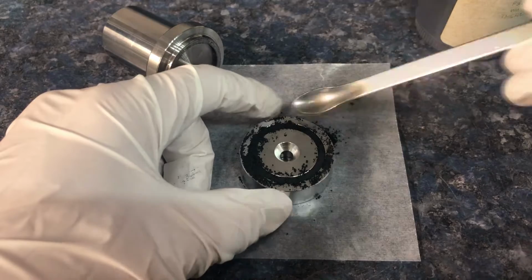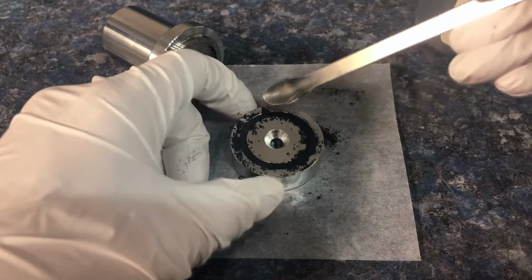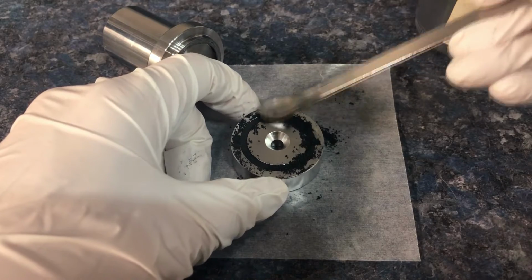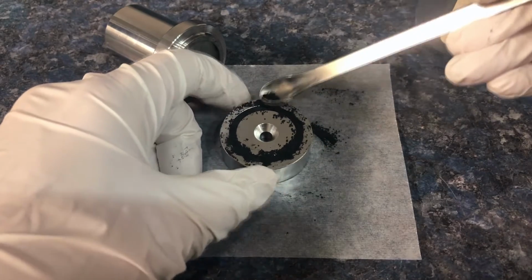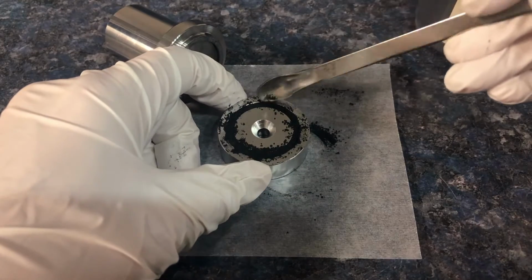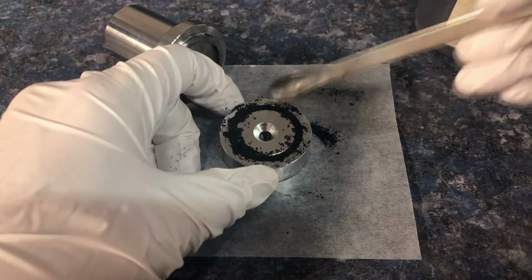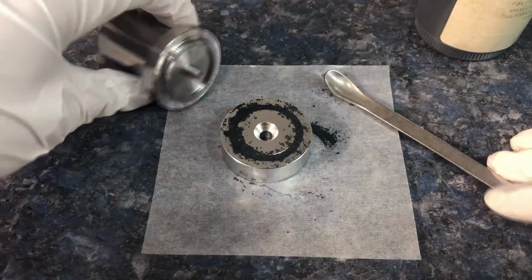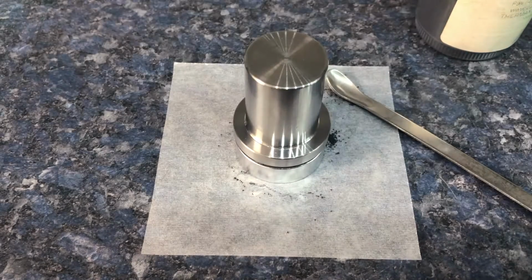If you do not have a lot of sample, you can use KBR to build it up from the bottom and press the KBR. Once you have your KBR ring, you can sprinkle your sample on top and press it. This allows you to have your sample on top of an inert support that doesn't give you vibrational spectrum. The only downside is if your compound reacts to the solid KBR. This does not happen often, but it can happen.